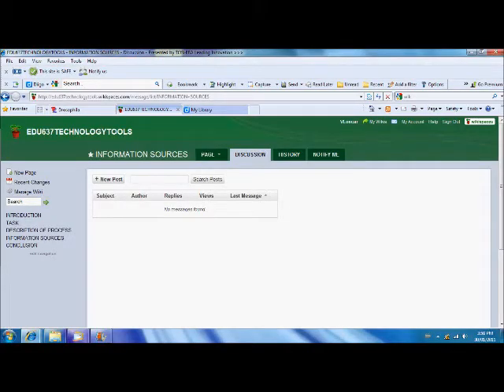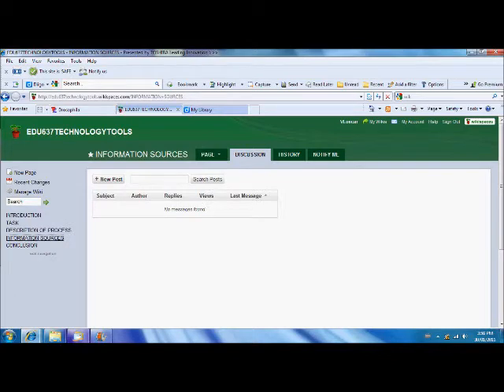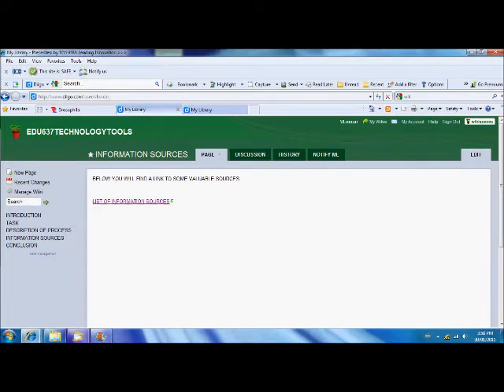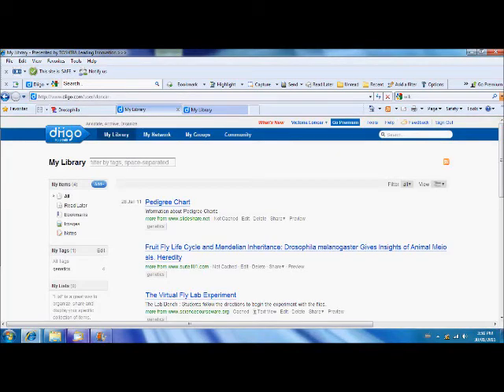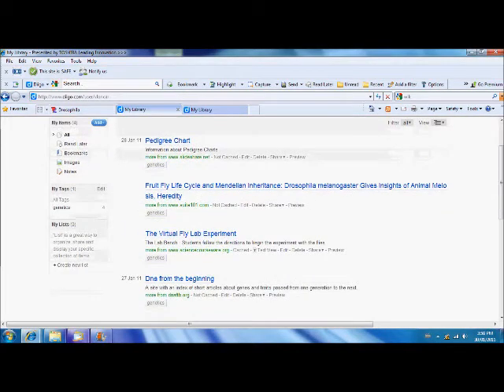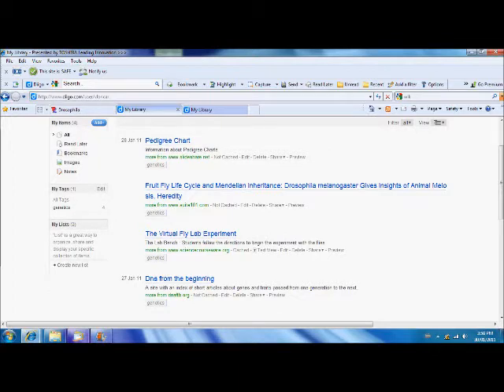I'll take you to the website and give you an example of what you have to do. The first thing you have to do is go to the information sources you'll see in the menu on the side. Once that comes up, you'll see that there's a link to a list of information sources. Click there and it will redirect you to a Diigo site. And there you'll find the virtual fly lab experiment. Click there.